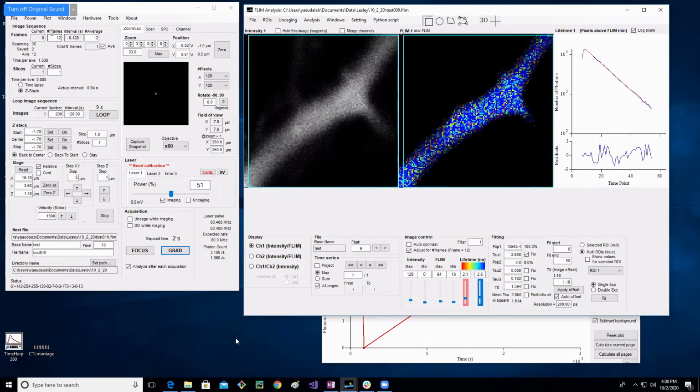So you always have a choice of how many frames to take and how many frames to average. Well, that's not entirely true. For most imaging, unless you're imaging extremely fast, you'll always average the number of frames that you take, because we basically use frames just to increase our signal to noise.